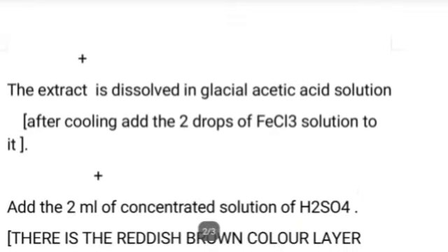Next, dissolve the extract in glacial acetic acid, and since the glacial acetic acid is hot, we have to cool it for a few minutes.